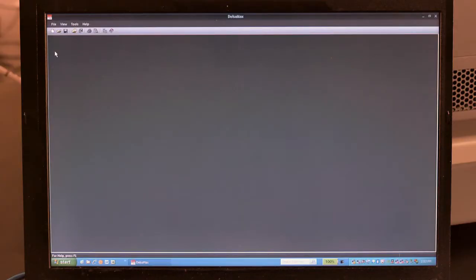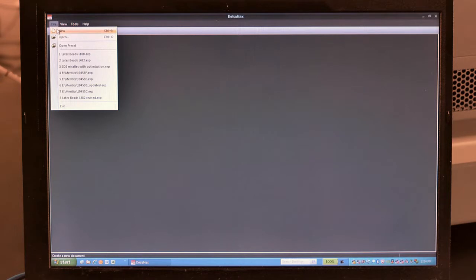So now we have our standard L50 latex beads loaded into our DelsaMax Pro instrument, and we're ready to begin analysis. These L50 beads on their assay sheet have a standard size of 42 nanometers in diameter or 21 nanometers in radius. To start the experiment, it's very simple. We open up a new experimental file.